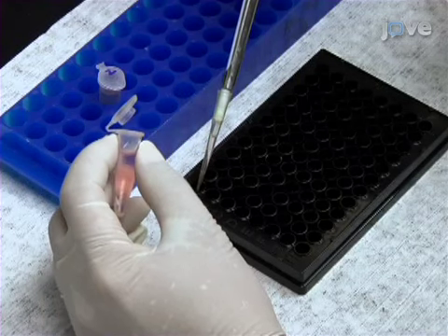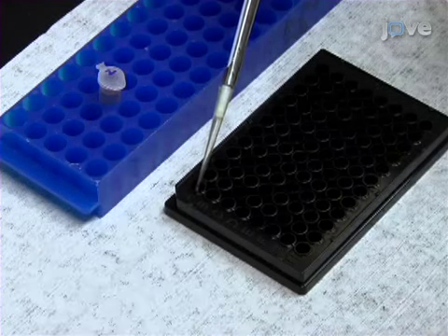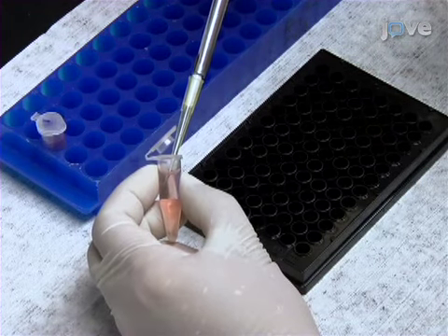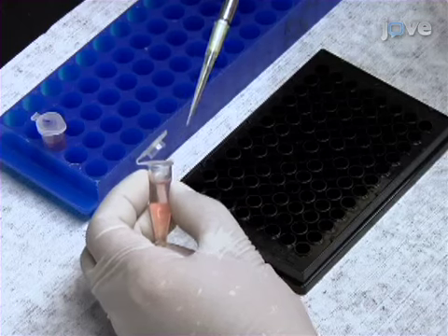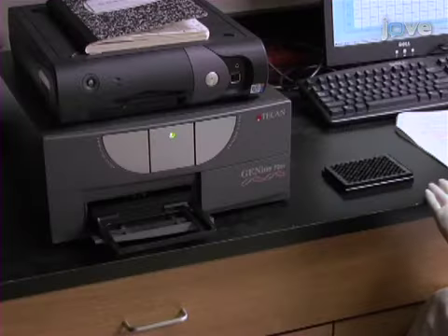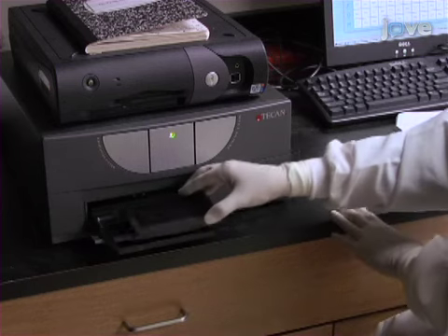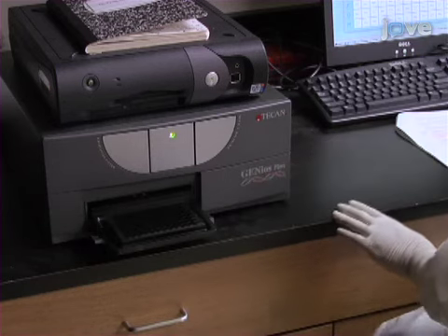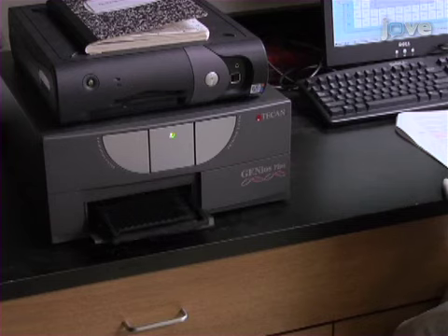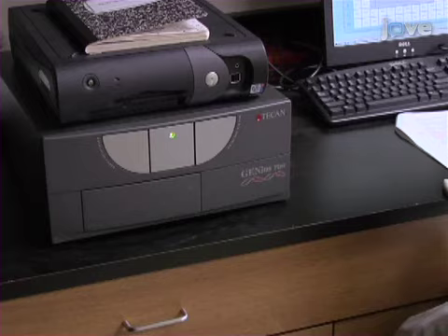Then, to assess inhibition of Nef-GFP secretion, transfer 100 microliters of the cell-free conditioned medium to individual wells of a 96-well black microtiter plate. Use a fluorimeter with excitation wavelength 485 nanometers and emission wavelength 515 nanometers to measure the GFP fluorescence in the medium in relative fluorescence units.